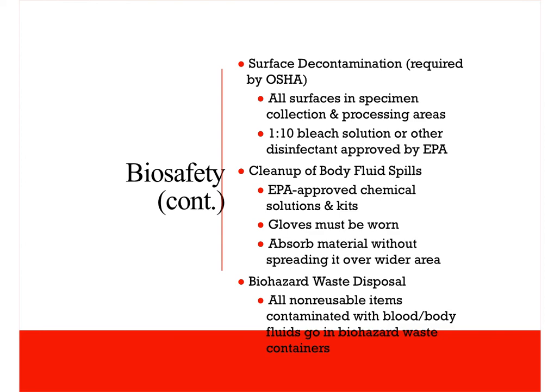Surface decontamination is required by OSHA. All surfaces and specimen collection processing areas should be disinfected. We use a 1 to 10 bleach solution or other disinfectant approved by the EPA. So 1 to 10 bleach, if you are making the solution, means 1 ounce of bleach to 10 ounces of water, okay? Biohazard waste disposal. All non-reusable items contaminated with blood or body fluids go in biohazard waste containers. That is if they're saturated, okay?